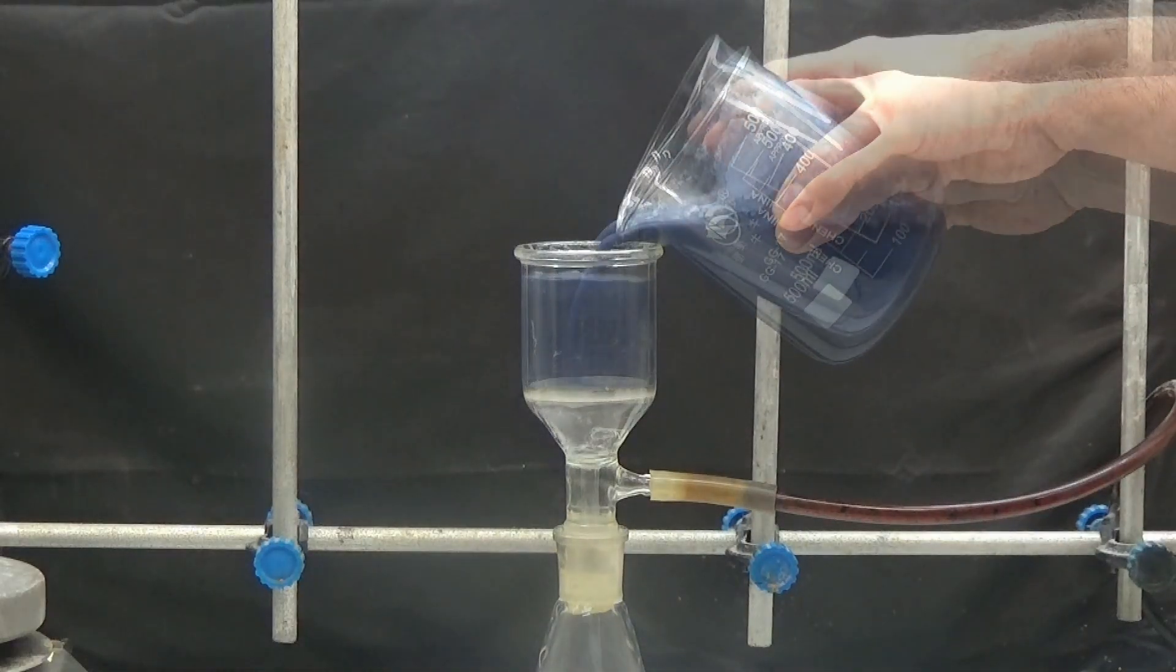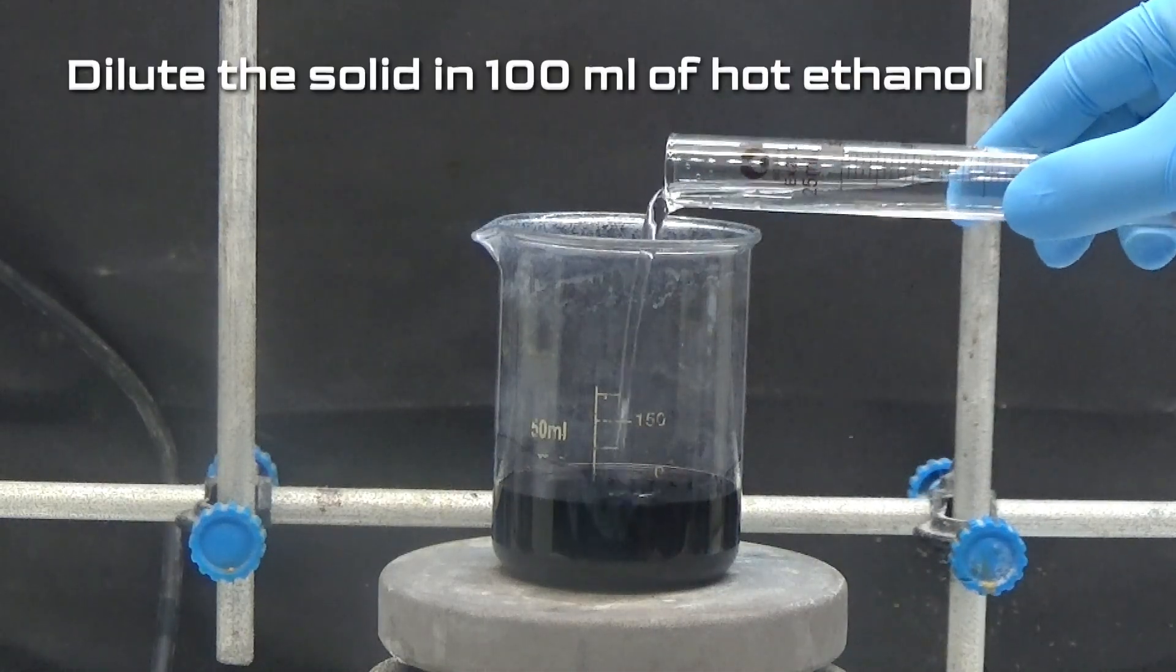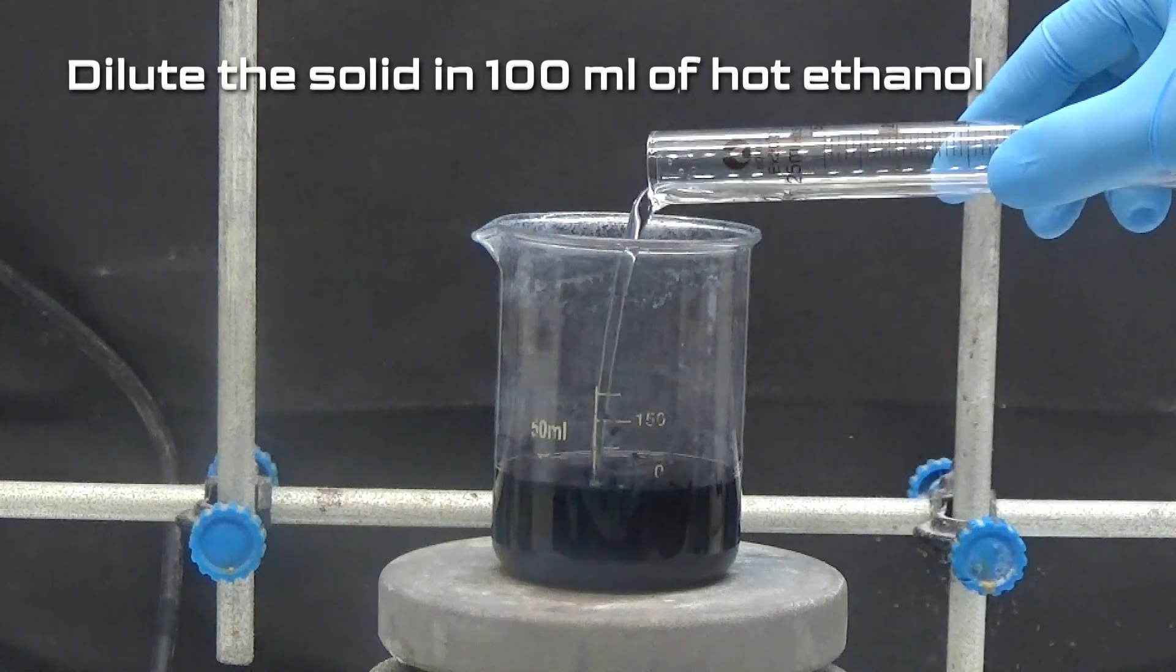Collect the precipitate by suction and wash twice with little water. Dissolve the solid in 100 milliliters of hot ethanol.